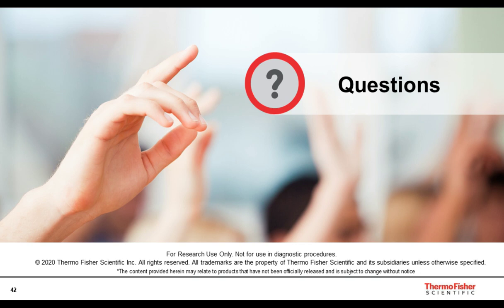Okay, Matt, our first question came in kind of early in the presentation, so you might have already addressed it. But the question is, what's the maximum length of the insertion sequence?